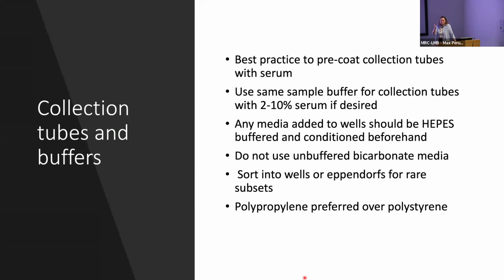So if it applies a positive charge, then it will start applying a negative charge. That will have an effect of a net neutral charge of the drops in the collection tube, and that's quite helpful actually for neuron sorting.